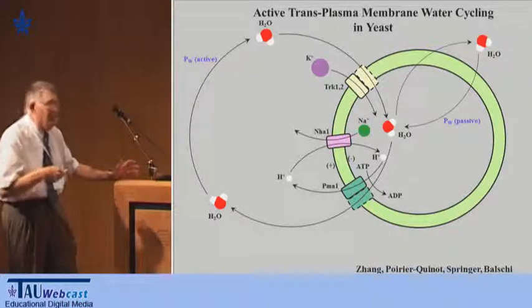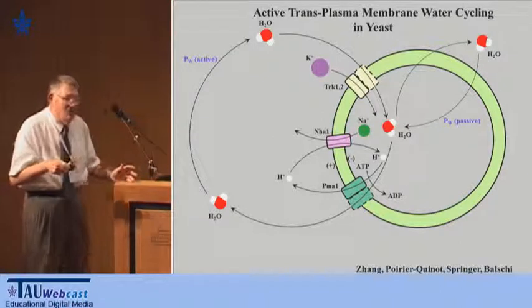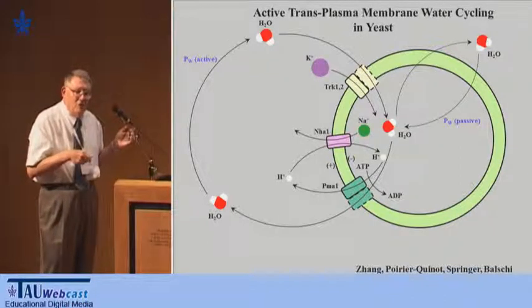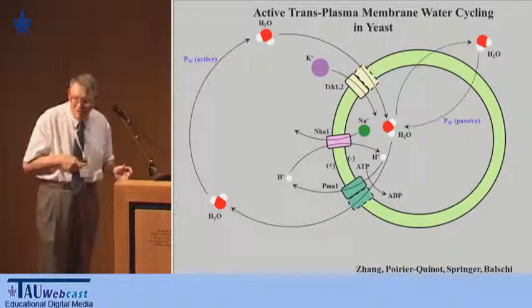And actually, I think this has implications for many of the metabolic features that have been mentioned in the last 2 or 3 days. And we started measuring tau I a long time ago in DCE MRI, and this offers a metabolic dimension to DCE MRI.